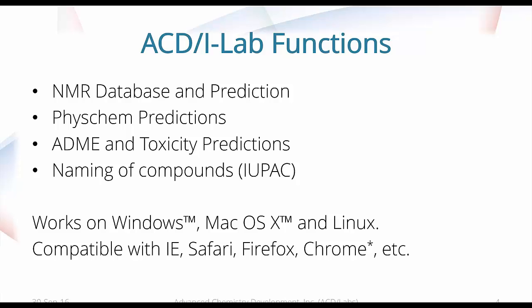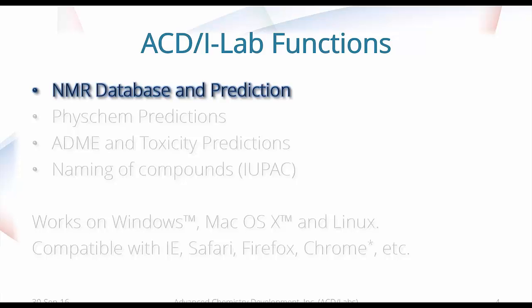Now, ACD iLab can do quite a few functions. It offers an NMR database and prediction. It offers physicochemical predictions. It offers predictions for ADME and toxicity, and also naming of compounds according to IUPAC. On this webinar today, we are going to talk about NMR database and prediction.